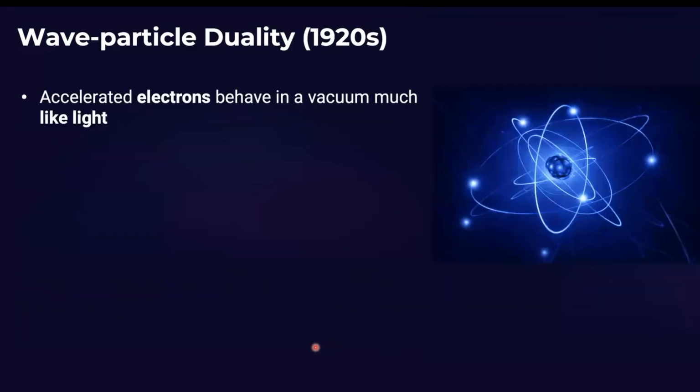What does it mean? If electrons behave like waves, we can use electrons instead of light. We can remember how Abbe's diffraction limit works: the smaller the wavelength, the higher the energy, the higher the resolution. But how to do this?